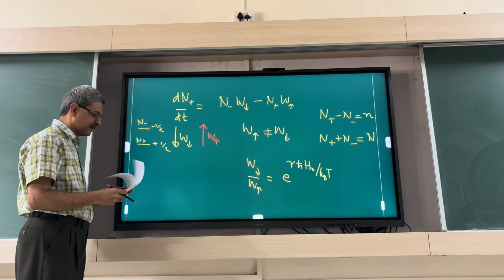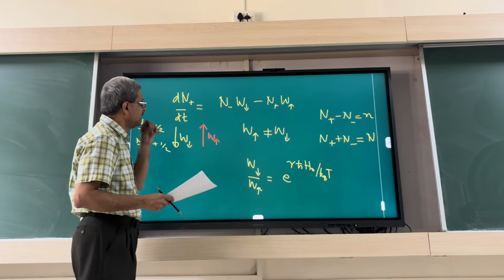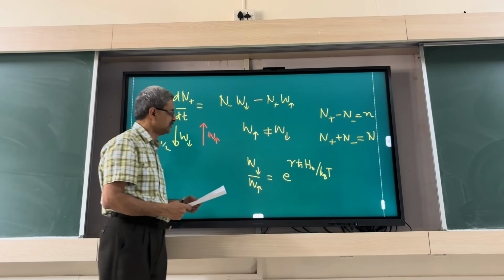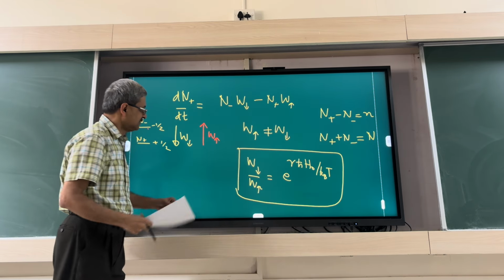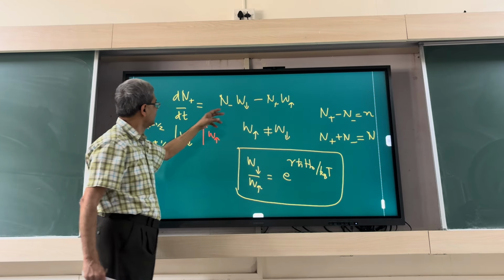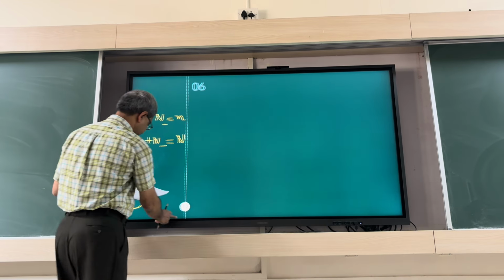So this is one thing, and the other thing is that this is just determined by what the equilibrium population ratio is. Once the ratio of these rates is known, you can put that back in here and then do your dn minus by dt and then take the difference, or d small n by dt, etc. So it's a small piece of algebra you can work out.